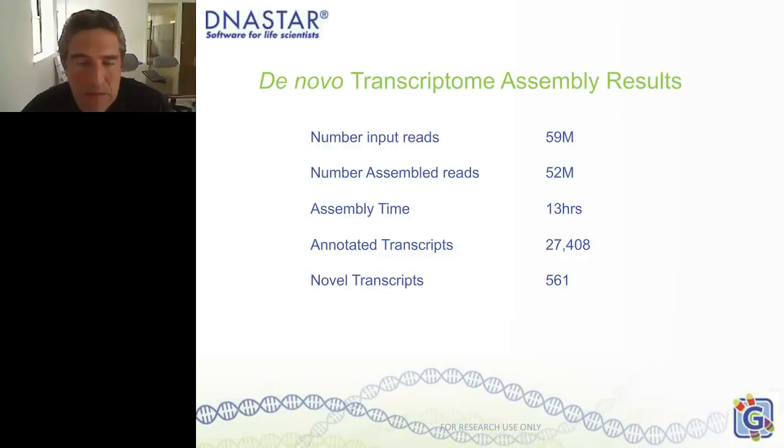Some of them are considered novel. They really didn't hit anything strongly. So we have this kind of collection of unannotated transcripts as well. And so it's a real streamlined kind of workflow, and the output then is an interactive report. And this report then is, I'm going to grab a different kind of a highlighter here.